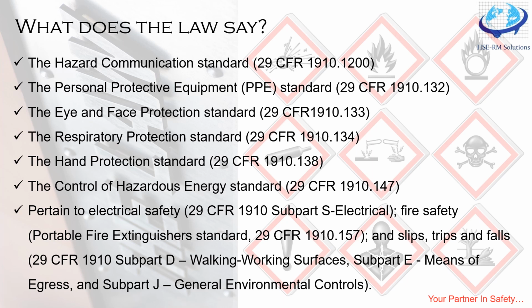Not depending much on PPE, it's always better to have safer means of transfer or handling of the chemical, defined in the hierarchy of control. As the standards say, the first standards that came to highlight, with the highest rate of exposure, were eye, hand and respiratory protection. Mostly while handling chemicals, these are the areas that cause most exposure, as we discussed when we talked about how exposure happens. So you must try to understand and define the need for protection. It's very important. We mostly talk about means of protection, but we forget that how we have defined it, you need it, but why is to be explained.